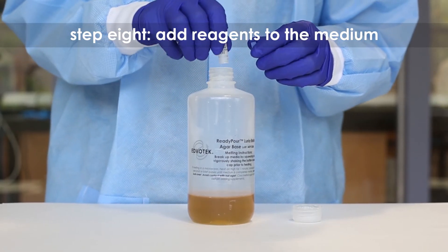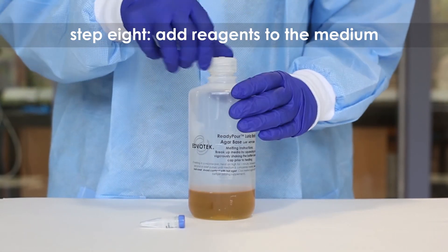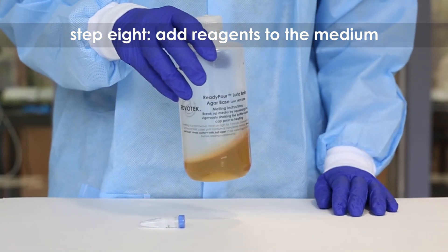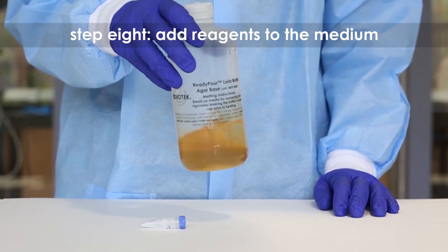Step 8: Add any media supplements to the remaining ready-pour, such as antibiotics, as specified in the protocol. Recap and swirl the bottle to mix. Only add reagents to the cooled medium.